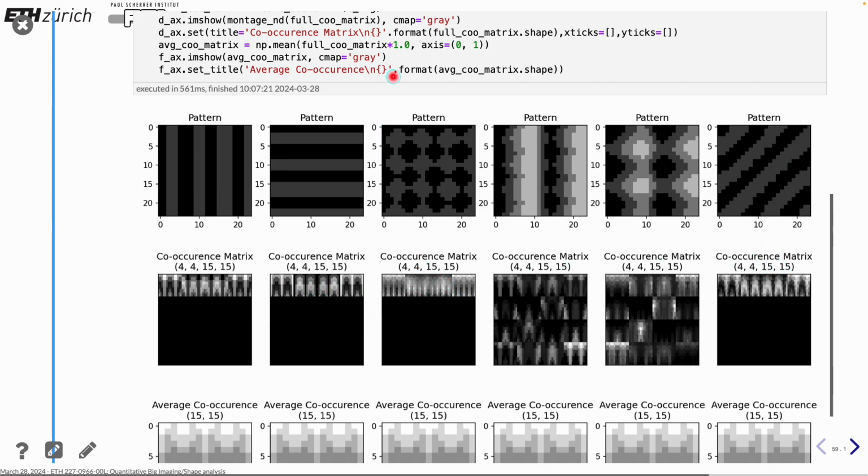The dot pattern looks a little bit different. And when you get into more gray levels, you can see that it fills out here. And that is because we have more gray levels to play with in this analysis.